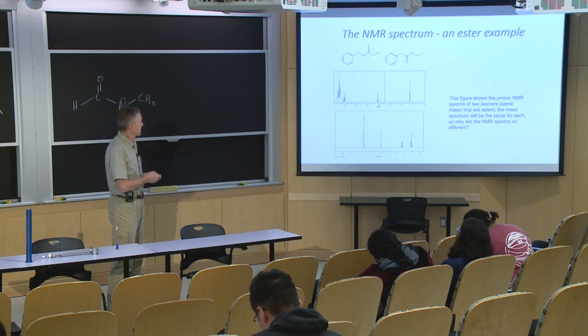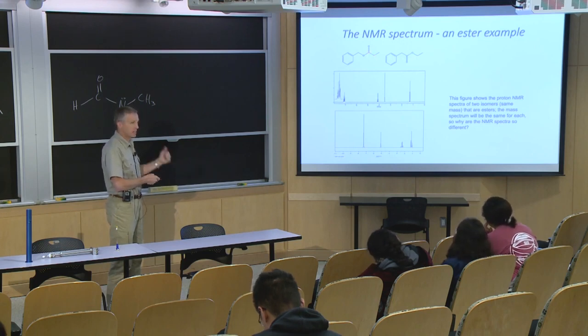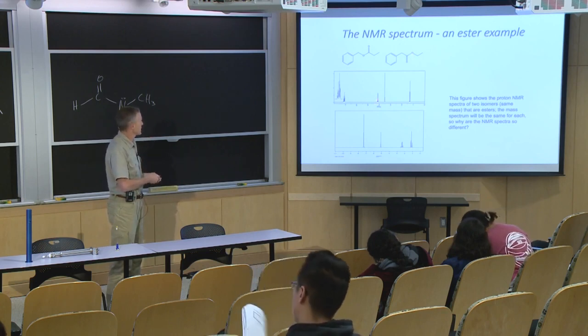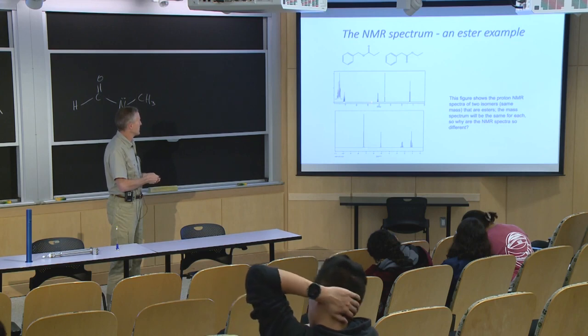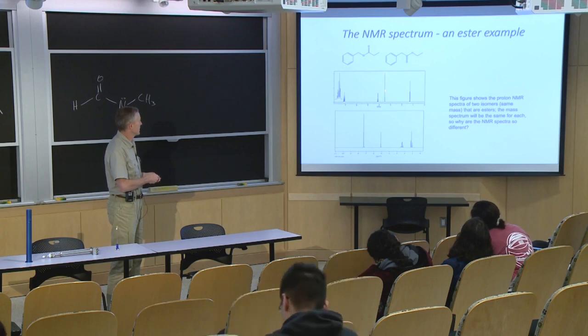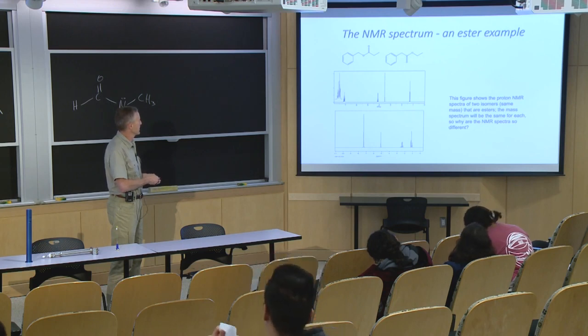Now, that's not to say that also in this one, they're not going to be split into a triplet and a quartet, but this carbonyl carbon is not going to drag the peak as far downfield as it does over here. So this peak right here is my single methylene that doesn't have any protons next to it.